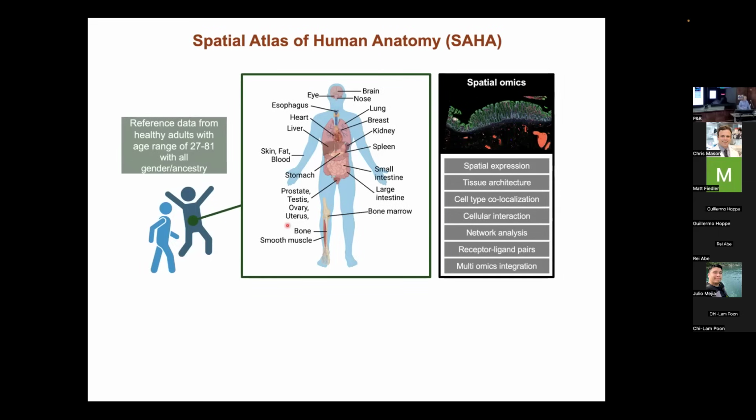Say this again? Oh, none of these are autopsies, so I should be very careful. This is all either biopsy or surgical material, but normal. We're not doing like, oh, we have colon cancer and then we're taking this area. These are patients that, for whatever reason, have had either resections or biopsies for other reasons that we as clinicians in the group would not believe would be an issue. And we've been doing this in very close collaboration with the pathology team and have brought in domain experts from each of the individual organs to ensure we have complete agreement on the clinical pathology side.